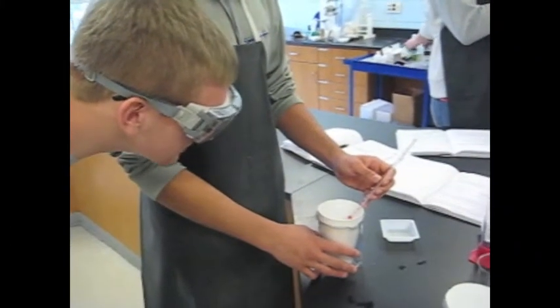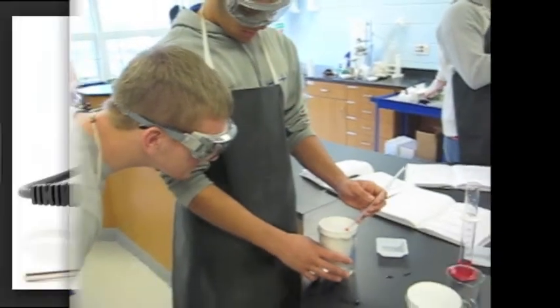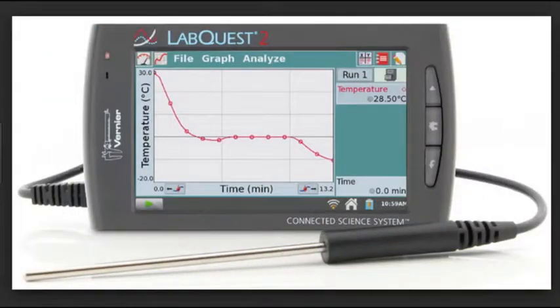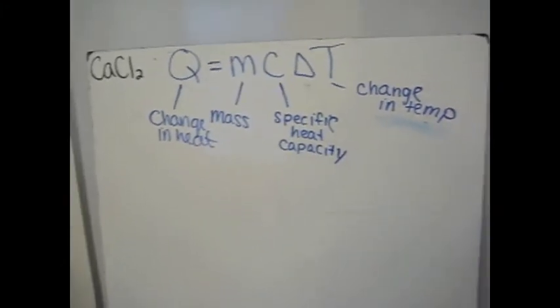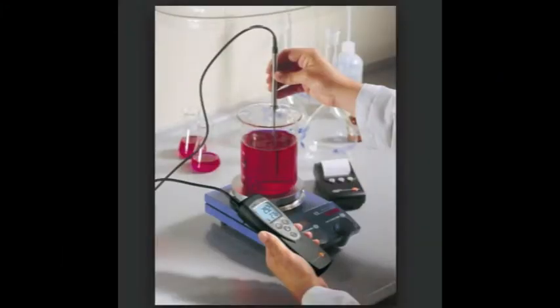The temperatures recorded in this experiment were taken using a thermometer rather than a lab probe. Therefore, the temperature changes recorded were not as exact, thus affecting the experimental enthalpy. This error could have been avoided by using a laboratory probe to record temperature changes.